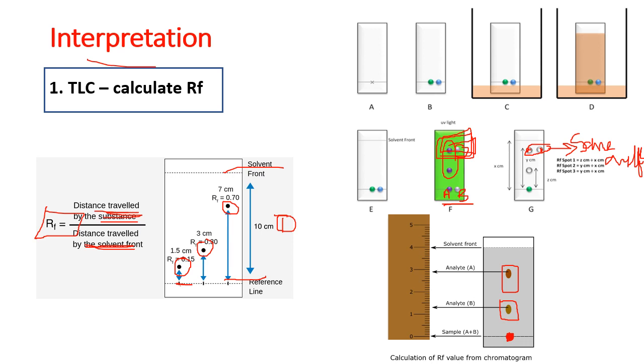What if I did an interpretation for this sheet? Then I have three samples, A, B, and C. In every sample, I just got one analyte, and the three analytes are different from each other since they have different RFs. Hopefully I made it clear for you.